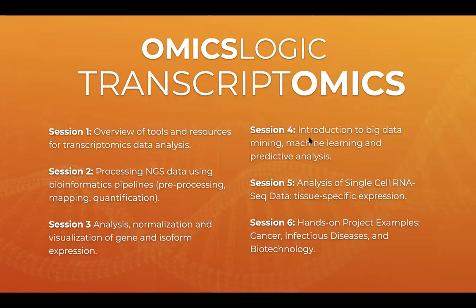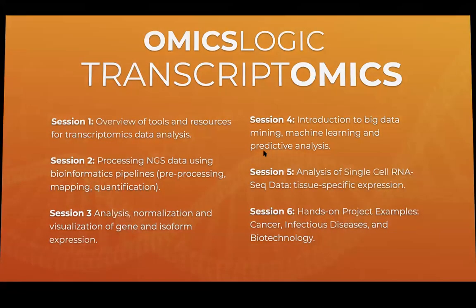And then we talked about how does all of this apply to individual projects. And so that's what we'll talk about today, because we will see that in projects, all of these strategies change based on the question that you're asking. And so it's important when we look at a project, we think through what are some of the important steps, how do we do the analysis correctly, and what might be some strategies to then apply validation. So what kinds of validation we can do in different examples.